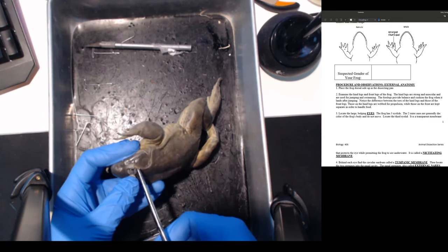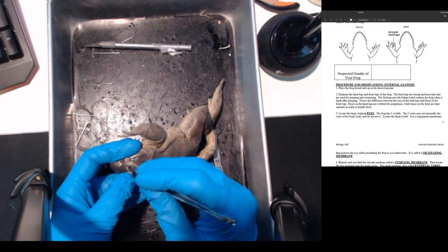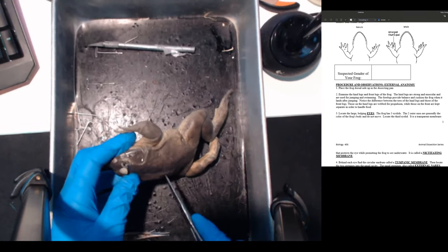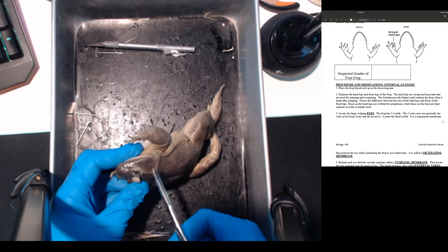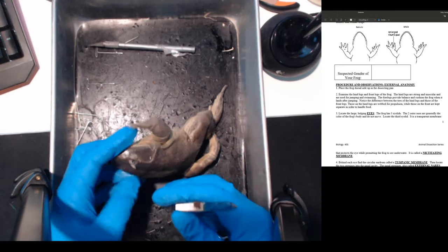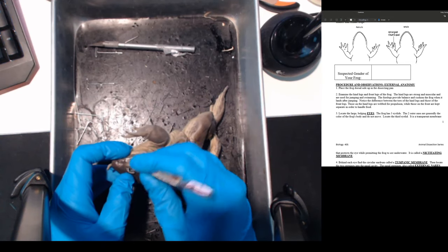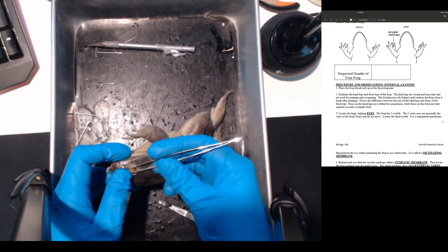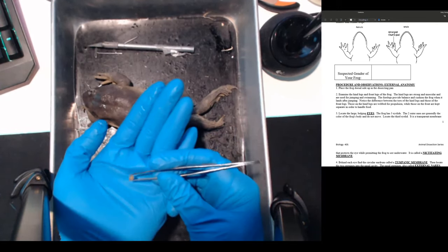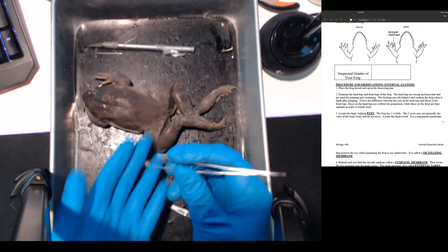What I'm trying to do is expose the eyeball - you can see the eyeball is somewhere in here and the juices are coming out. That's your membrane - because of these three membranes, it's great for living in water so the frog can still maintain vision underwater. There's the eyeball - just like a circular ball. We've exposed all three of those eyelids and this is just the eyeball.